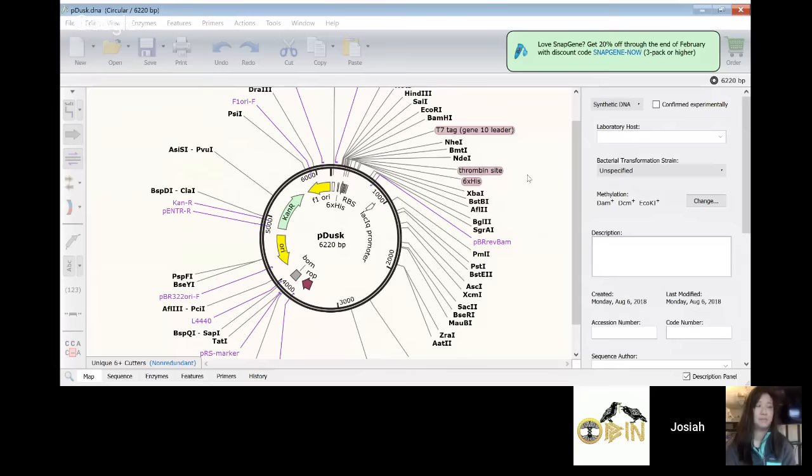So we're just going to take a minute and let you all catch up. Got it. Yes, good job. Go to AddGene. So when you go to import from AddGene, PCR should work on any DNA. So yes, it works on plasmids.